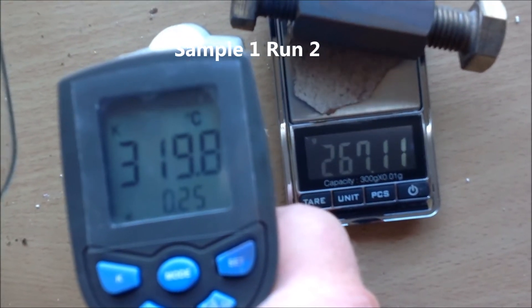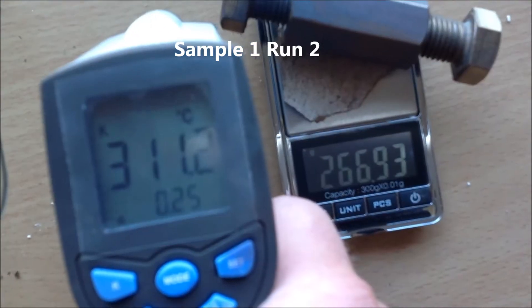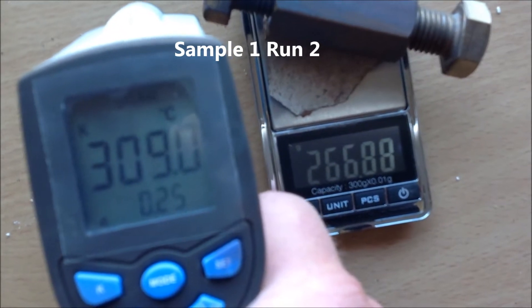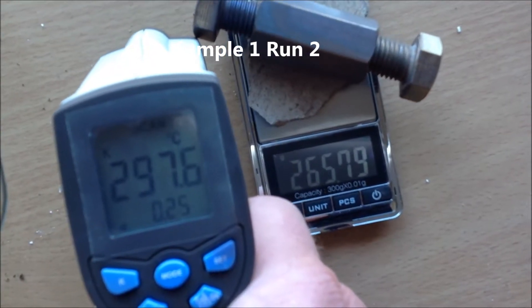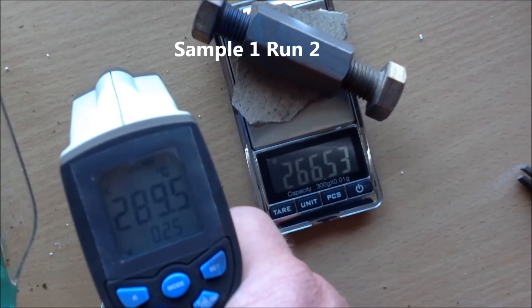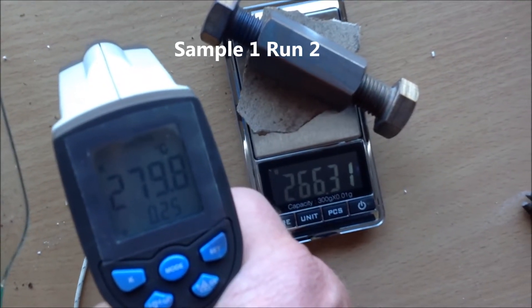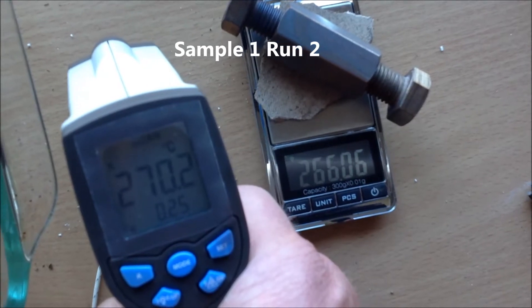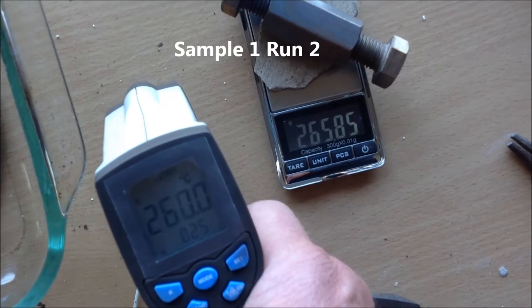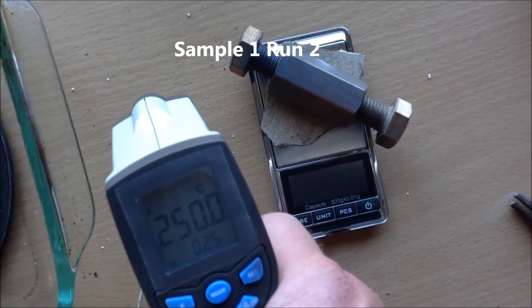320, 267.1. 310, 266.9. 300, 266. 290, 266.52. 280, 266.31. 270, 266.06. 260, 265.85. 250, 265.66.